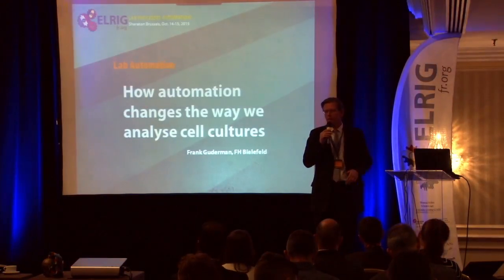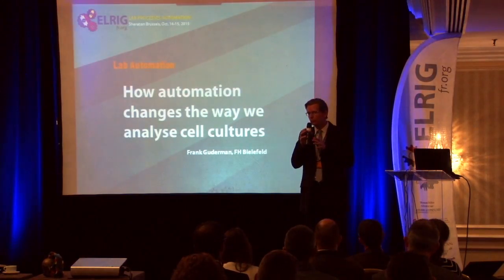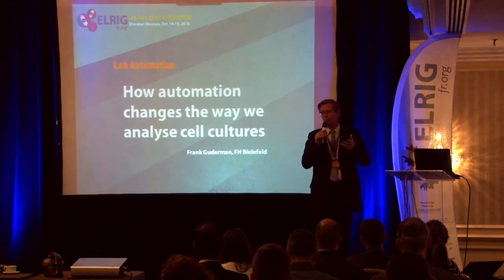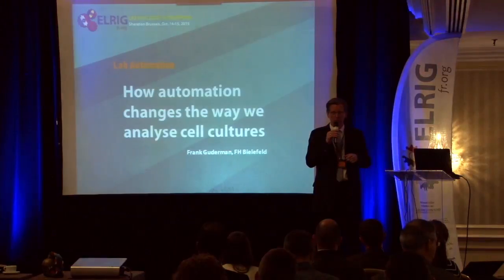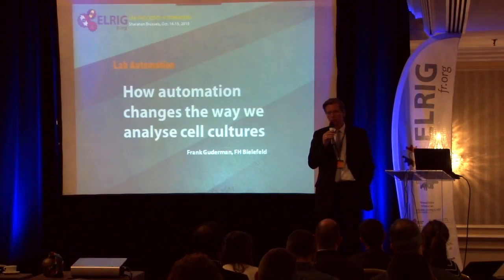Once you have this, like it is done in other automation concepts, you can use those routines and put them together. Add new ones, of course. For example, if you want the robot to use a different type of centrifuge, you have to reprogram for this centrifuge, as you have to do for any other automation, if you add an analyzer or another system. But the basic functionality is working.